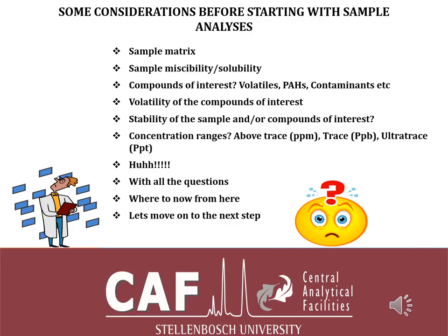And if it's a contaminant, what type of contaminant are you talking about? Is it a sulfur-based contaminant, or is it a chlorine contaminant? For example, maybe trichloroanisole, or is it phenolics, or halophenols?